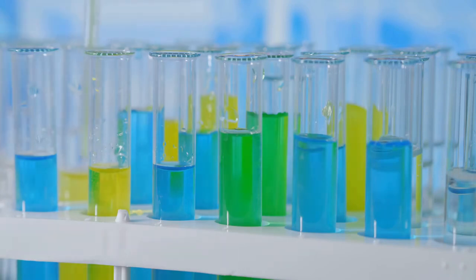The spectrophotometer doesn't just measure the concentration of a substance. With different wavelengths of light, it can even identify what the substance is. It's like having a superpower, being able to see the unseen, to decode the mysteries hidden in the light. So, in essence, the spectrophotometer is a tool that measures light to reveal the secrets of the universe. It's a beacon of knowledge, shining a light on the mysteries of our world, one wavelength at a time.